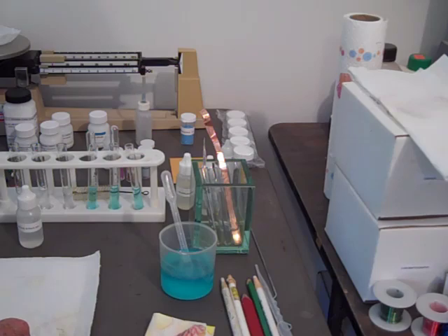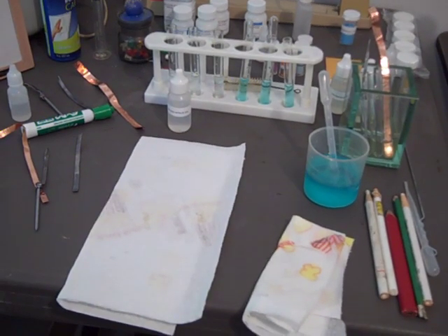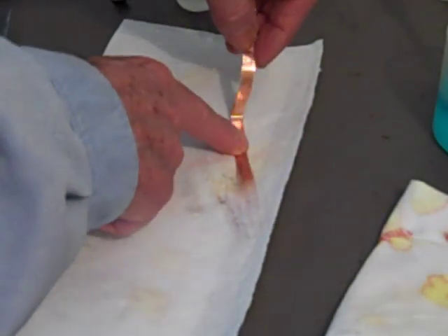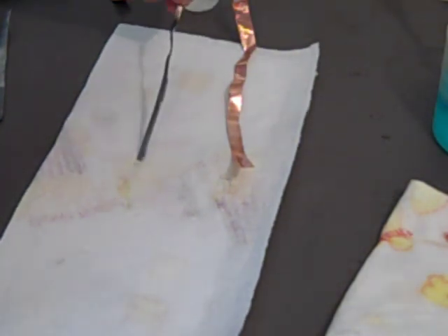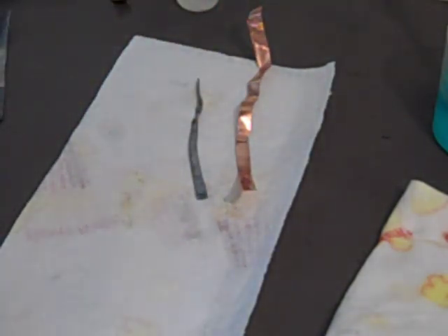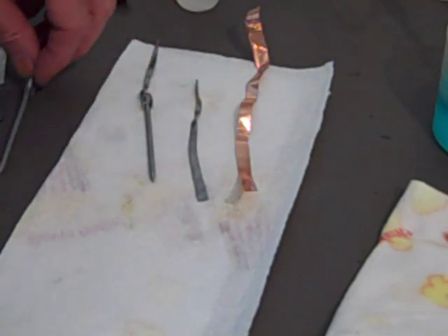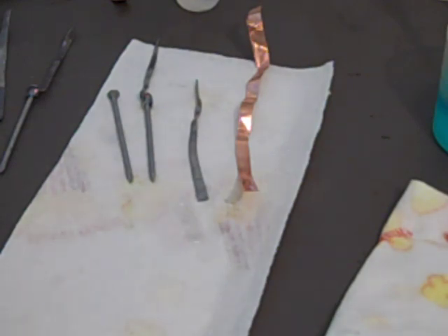And a simple galvanized nail. And we'll look at them here on a close up. Copper. Again, no reaction. We expected that. The lead. This is in the zinc solution. This time, no reaction. And the zinc should have had no reaction, but you know, this is the untreated nail. Again, very, very slight. Shouldn't have happened there. This is expected, no reaction.